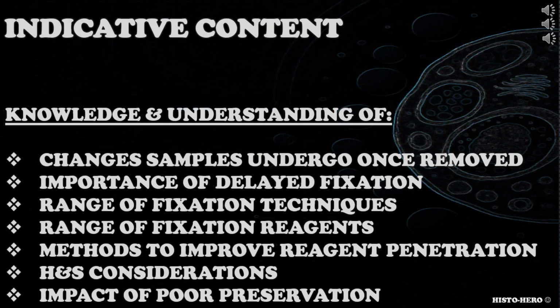What changes does the tissue undergo when removed from the body? How can these changes be minimized? Consider autolysis, putrefaction, anoxia, lack of nutrients, livor mortis, cooling, cell transfer media, freezing, fixation. Relevant to situations where delayed fixation is required and the importance of this.